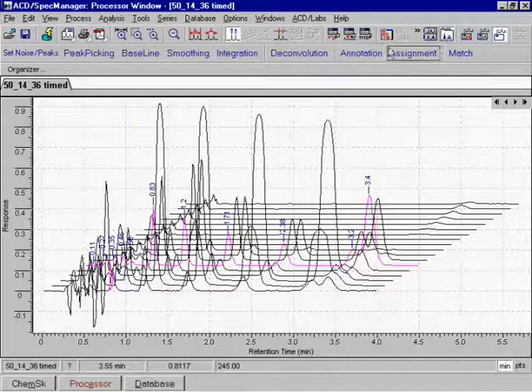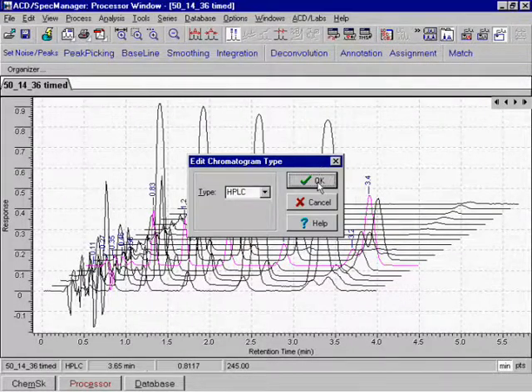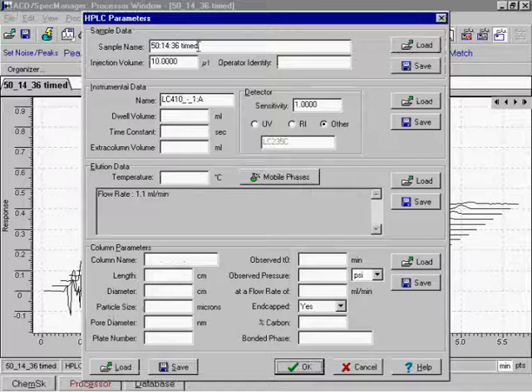View the imported sample and instrumental data in the HPLC parameters window.